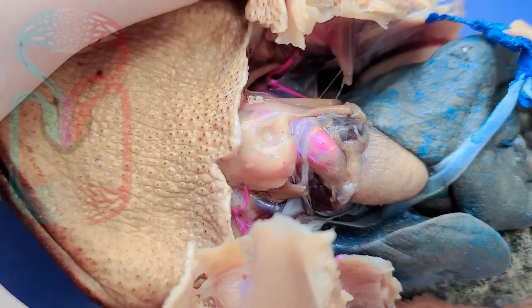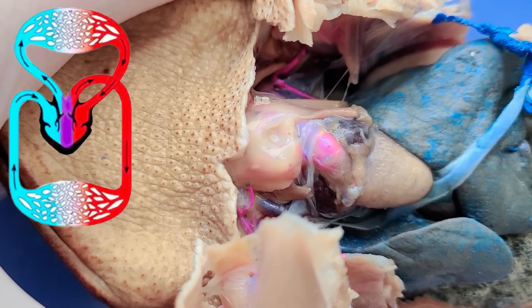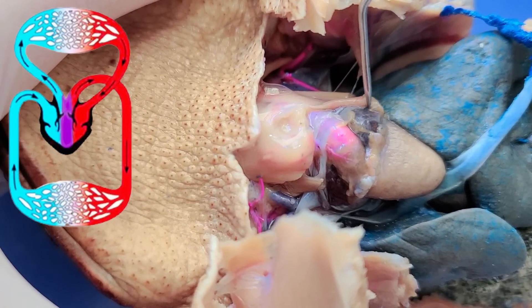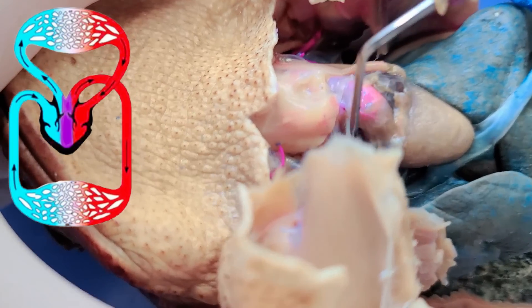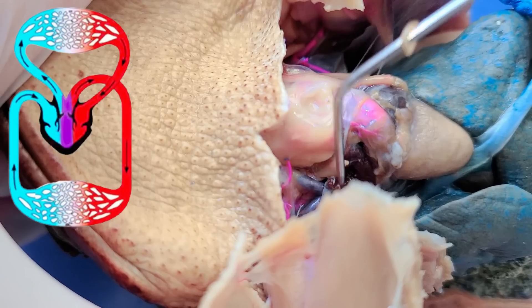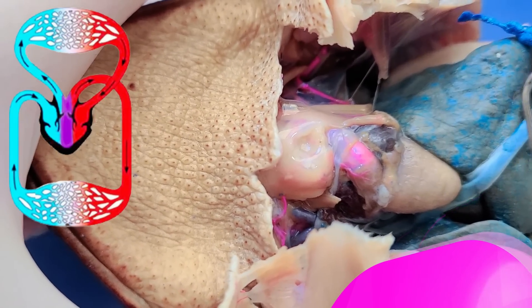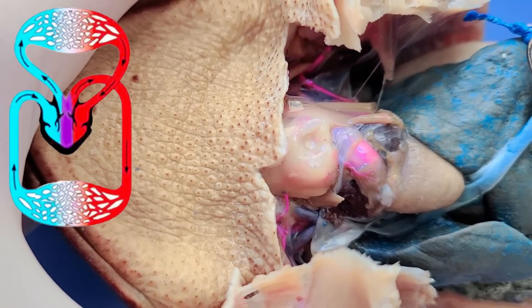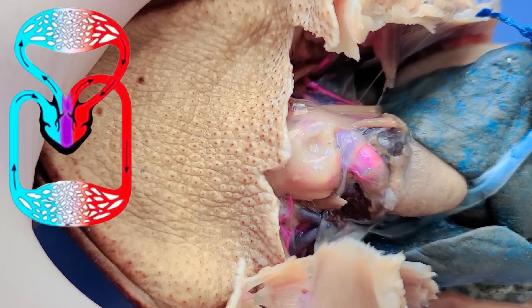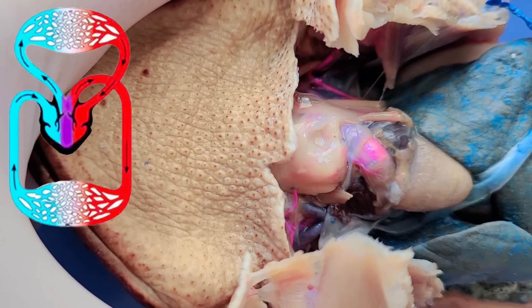Amphibians have a three-chambered heart, which means it has two atria. The atria are these dark triangles — one here, and another on this side. But only one ventricle, as you can see here. The disadvantage of a three-chambered heart is that oxygenated and deoxygenated blood can mix, which reduces the efficiency of the circulatory system.